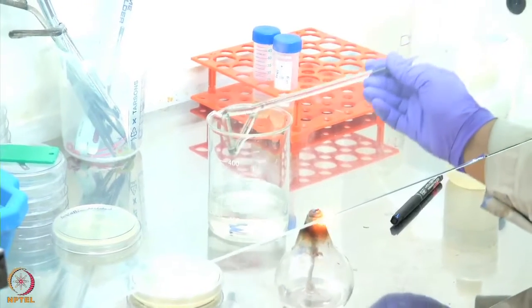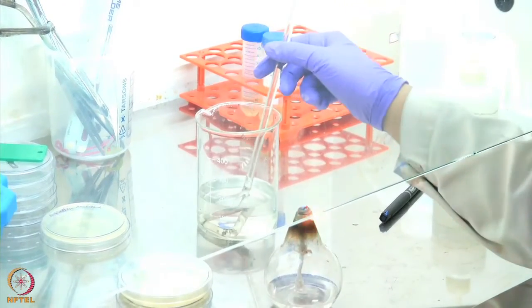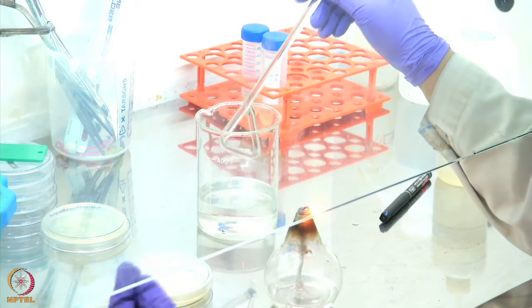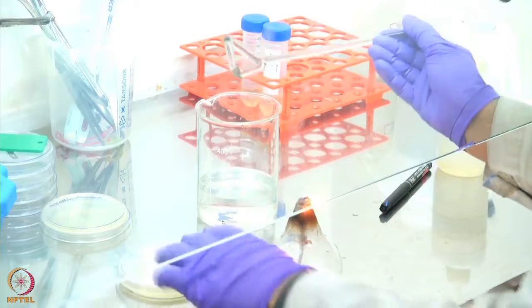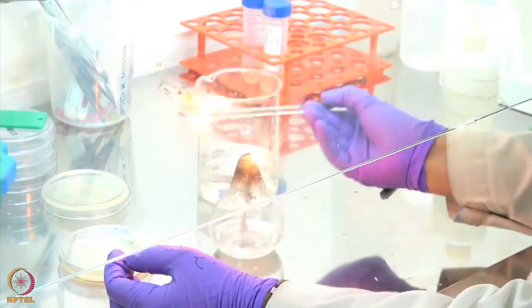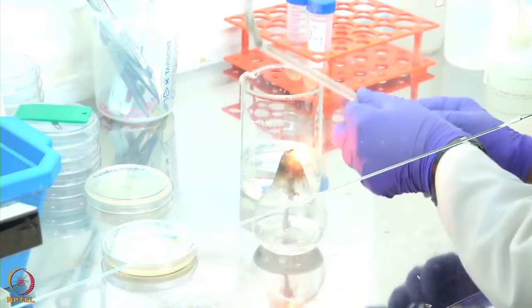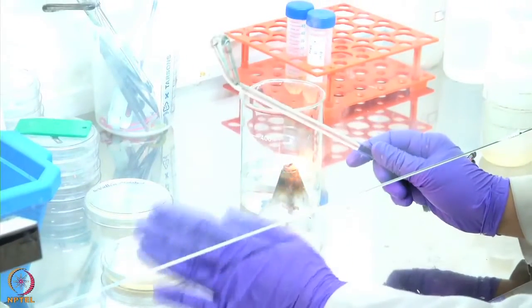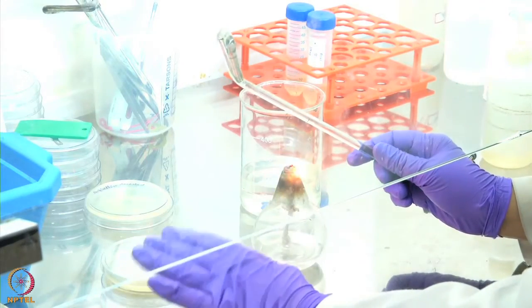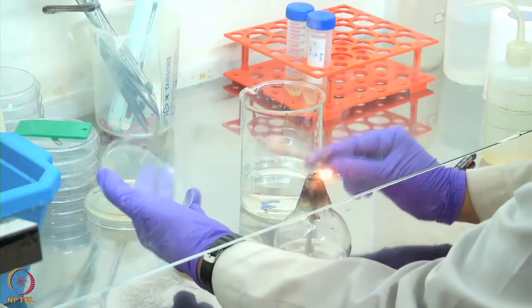So, this is the spreader which I am going to use for plating. This spreader is already dipped in ethanol so that all the microorganisms, if any, will get killed. I will put it to flame so that the alcohol evaporates. I will wait for the spreader's temperature to get down, because if it is too hot, it may kill my DNA sample as well. I can touch it here so that it becomes cool.